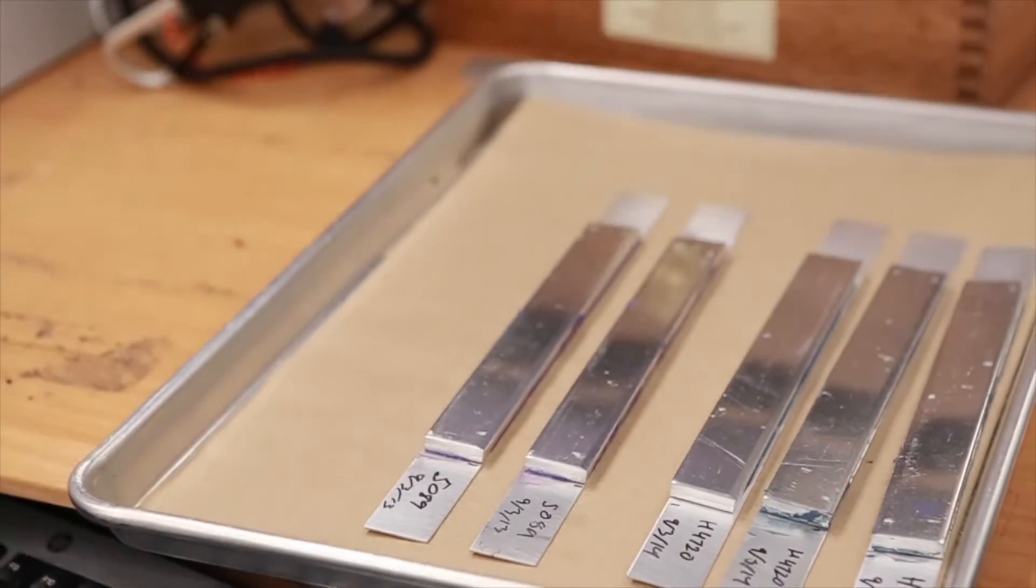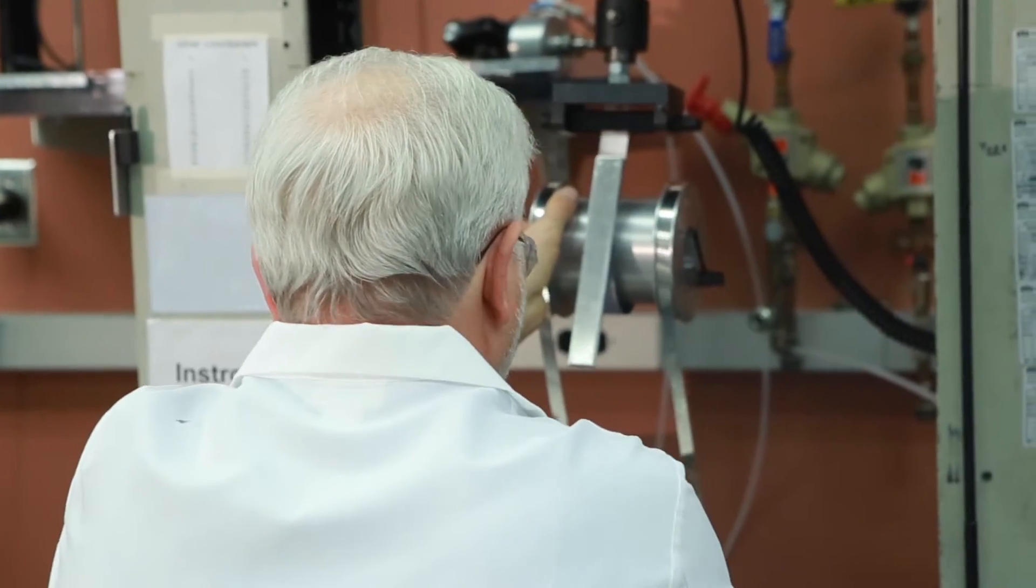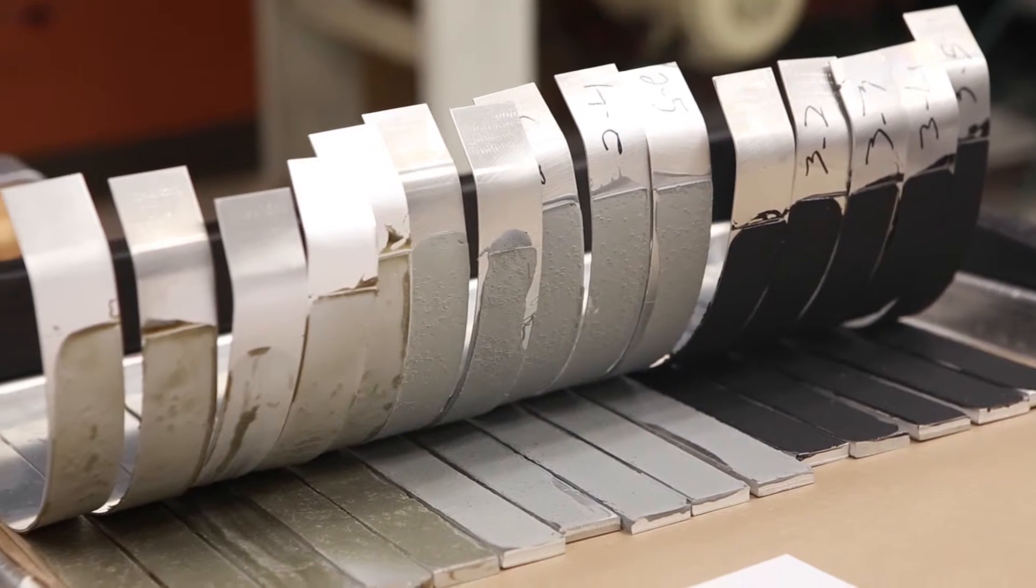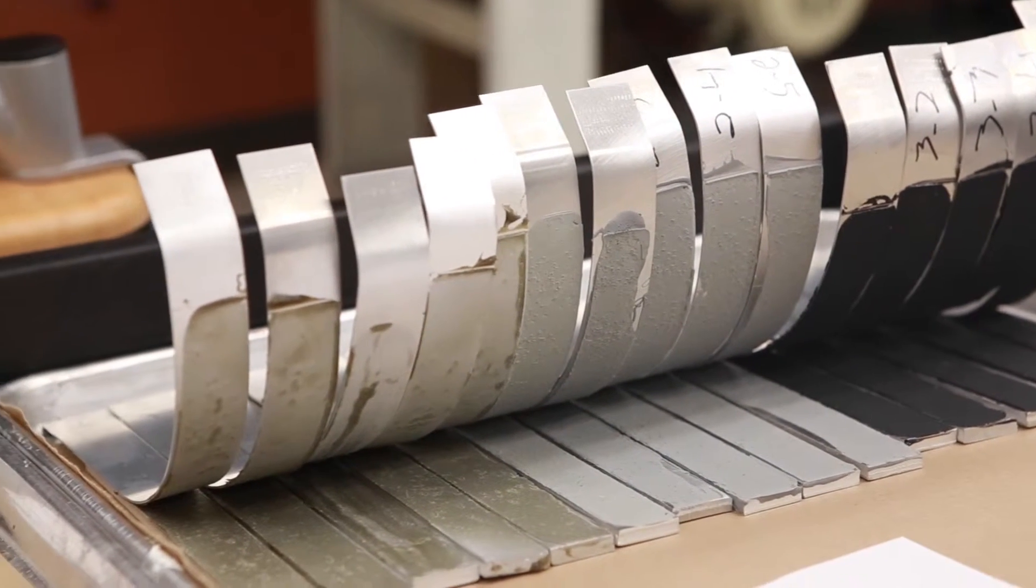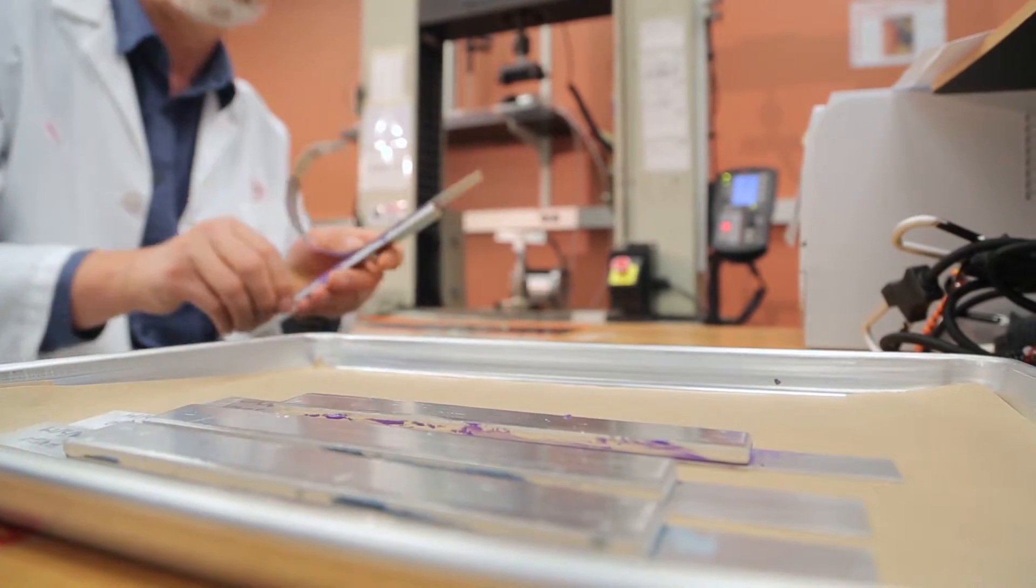Next we are going to test peel strength. Peel tests measure the average force required to fracture the adhesive bond between flexible materials when pulled at a specified angle. These tests are important for describing assemblies where the bond is subjected to peel loads. All of the applied load is concentrated on the leading edge of the adhesive rather than across the entire bonded area.